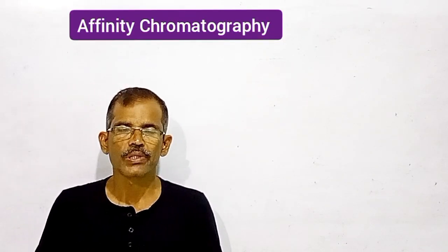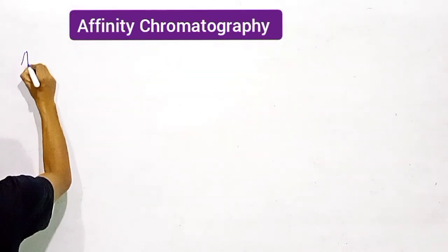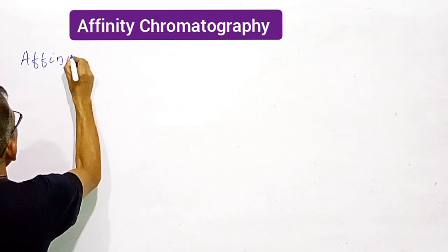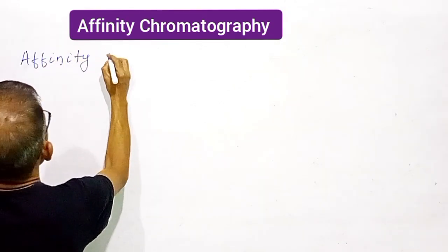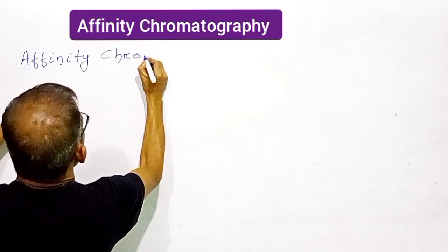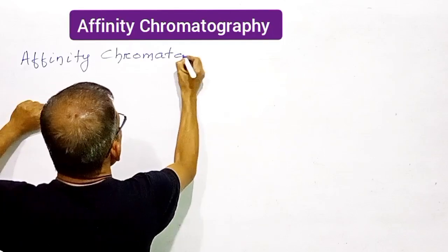Friends, today we shall discuss the principle, procedure and the applications of affinity chromatography.